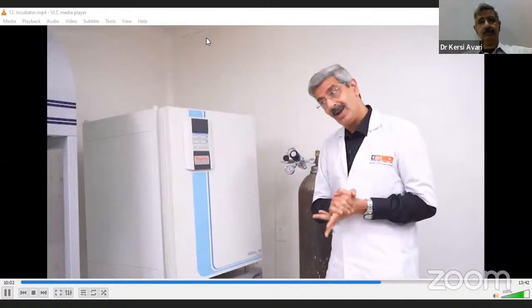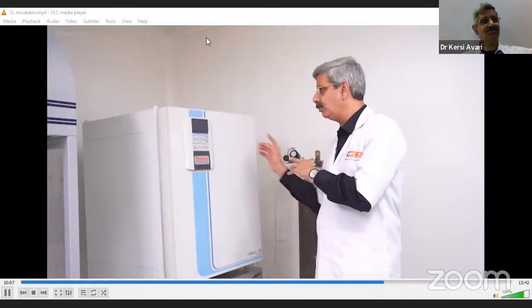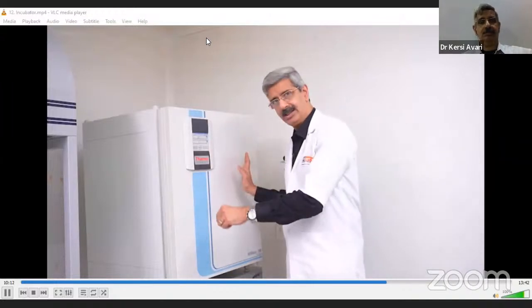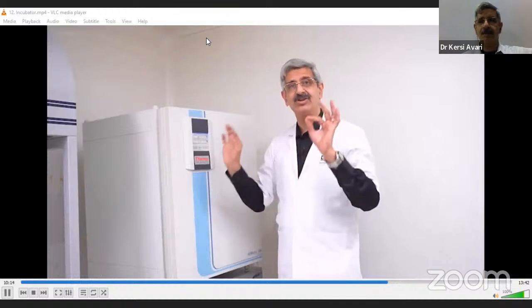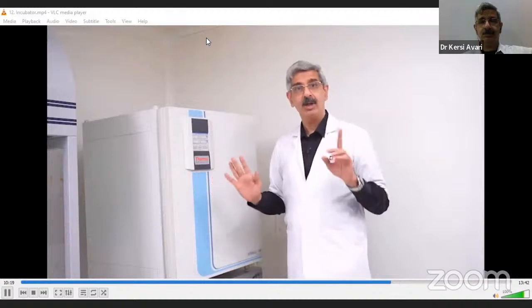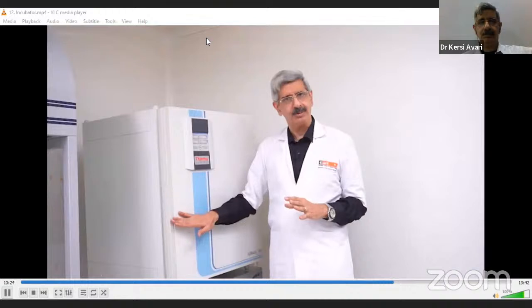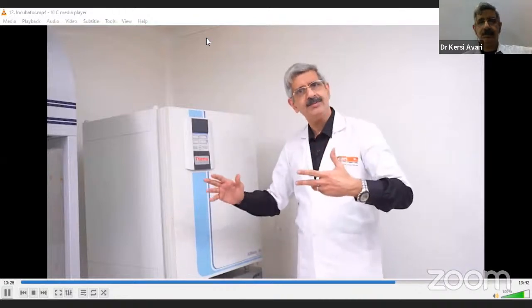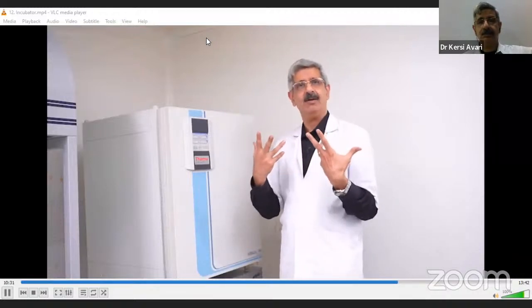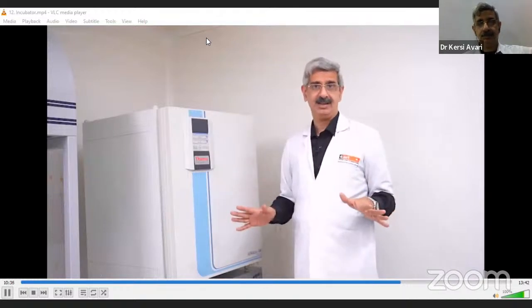So what we advise them is, under the worst of worst circumstances, you shut off the CO2, bring the CO2 to 0, close its source, shut it down, completely dry the interiors of the incubator. Absolutely dry. Because what happens? If there is a little bit of moisture left and you shut the door, next time when you open it after a month or even 2 months, you will be faced with that acid smell of the fungal infection. And then it will be very difficult to get rid of that.